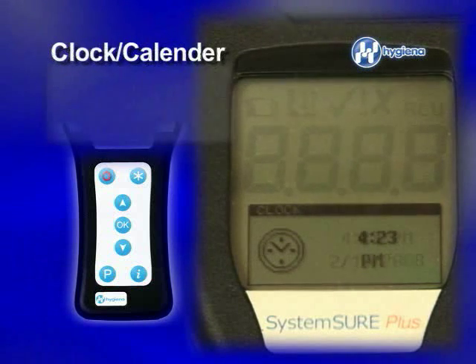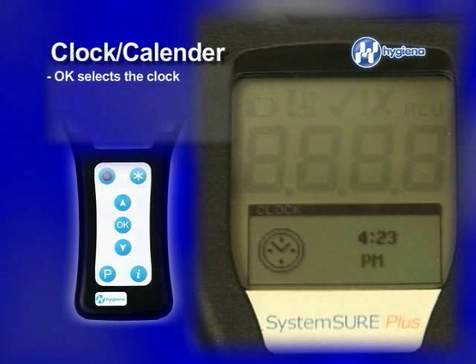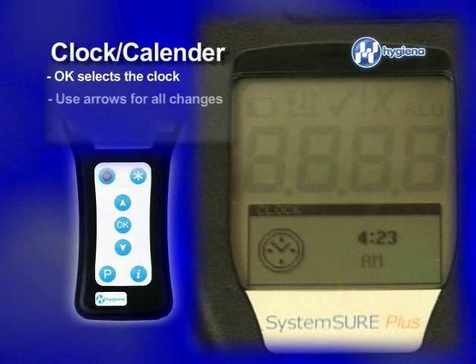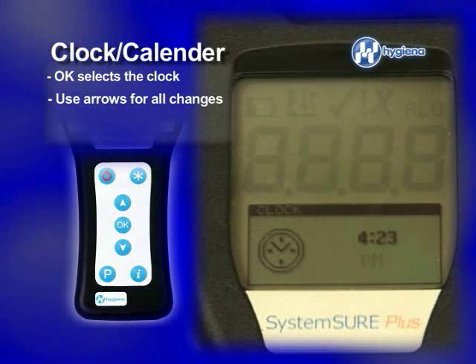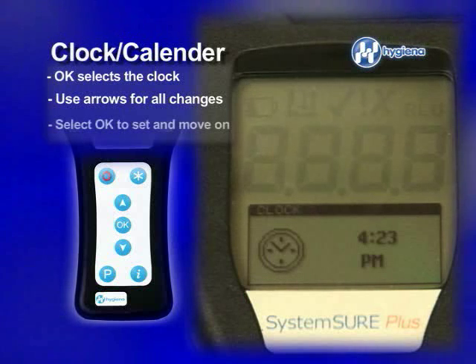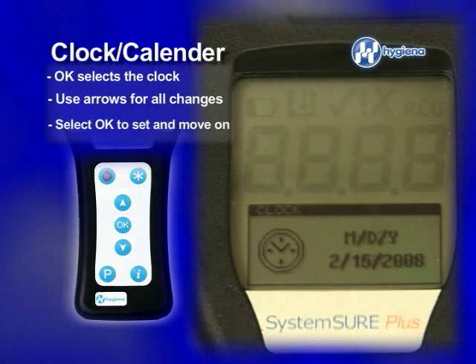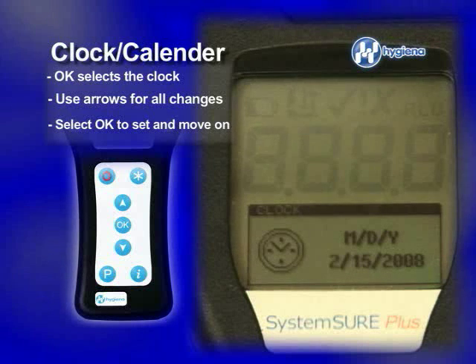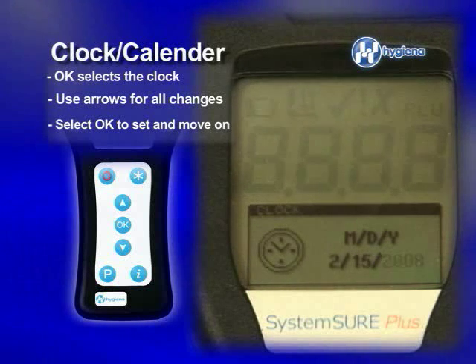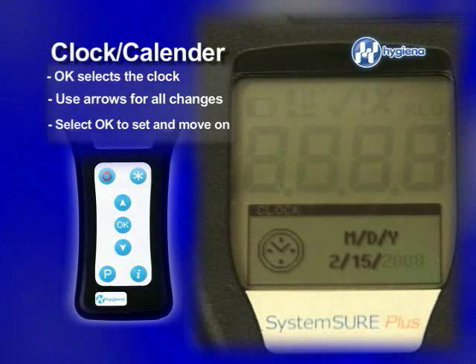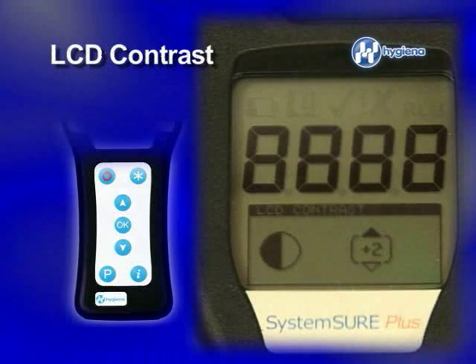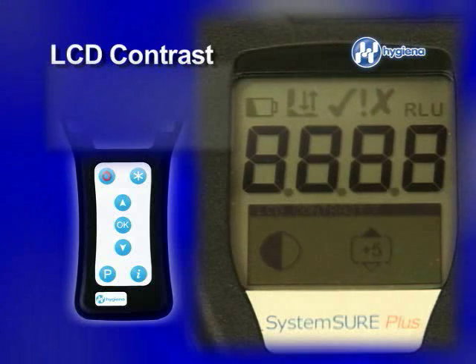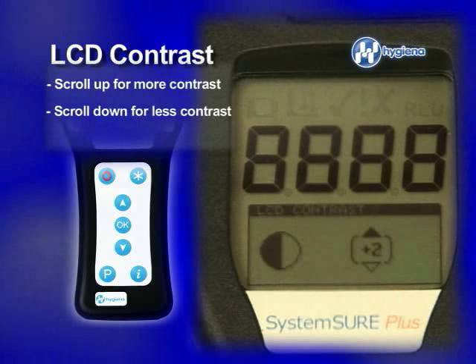Next is your clock and calendar. Select OK and it brings you to the clock. Scroll up or down for all changes. Select OK to move on to the hour and minutes. Make your changes, select OK, and repeat the previous steps to set the month, day, and year. Your final selection is the LCD contrast. To make symbols and data more legible, scroll up to create more contrast and down for less contrast.